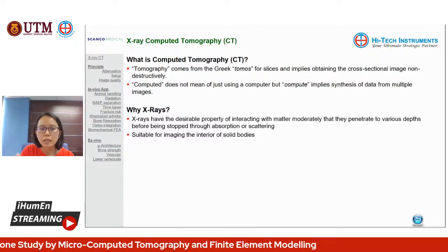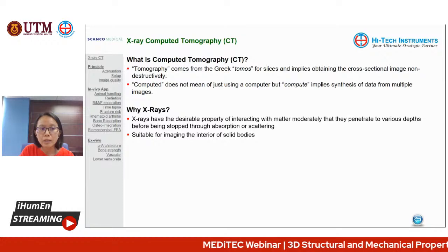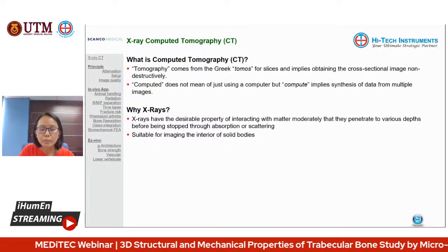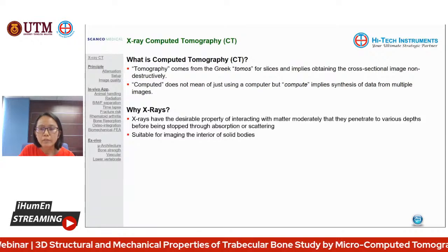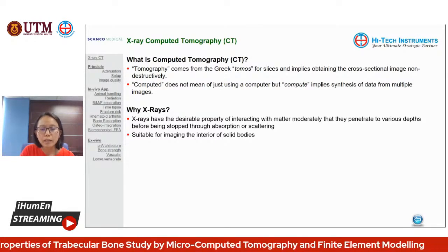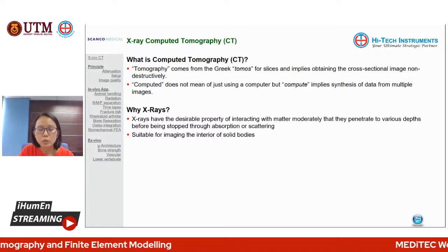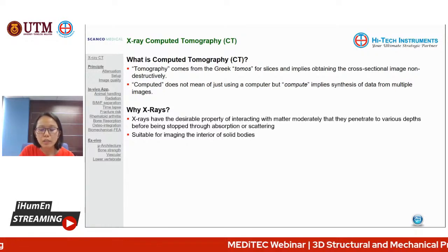Of course, X-ray has different energy levels. For biological samples, it is mainly in the range of 10 to 100 kV, whereas for materials like metal, or even for geology purposes, we have X-ray with higher kV, up to 200 or 300 or even 400 kV. For different kinds of material, I'm going to talk more about the property, the attenuation of this X-ray.